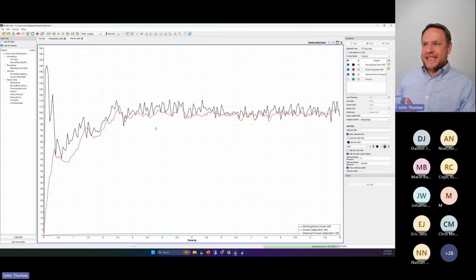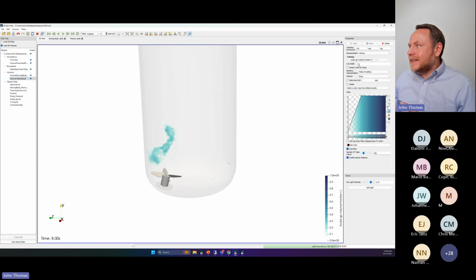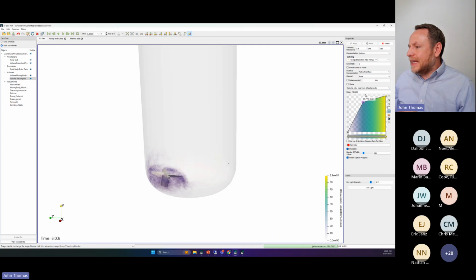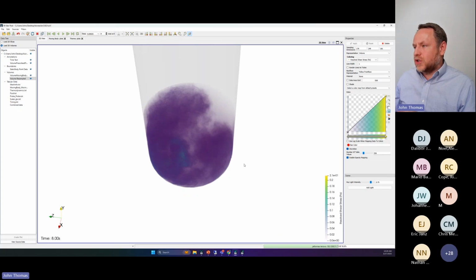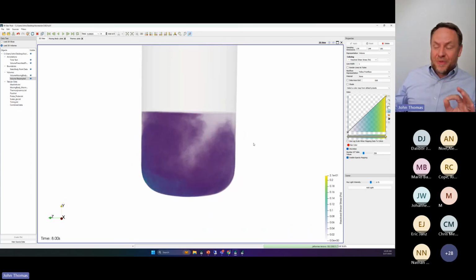This is a very compelling piece of data, and I'll explain why now. So I'm calculating inside this code the energy dissipation rate. I'm calculating what the EDR is at each individual cell, as well as the resolved shear stress at each individual voxel. I should say not cell, but voxel. This informs cell dynamics, of course. This is a really cool point.